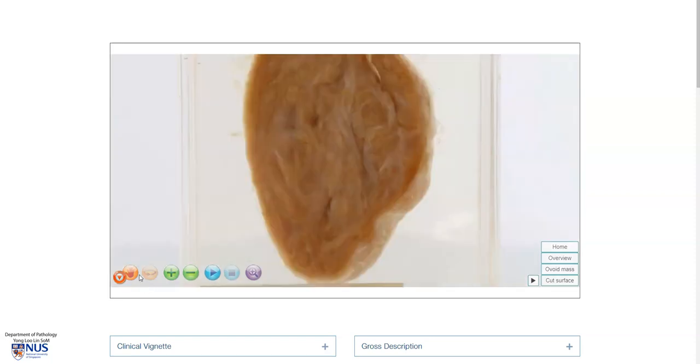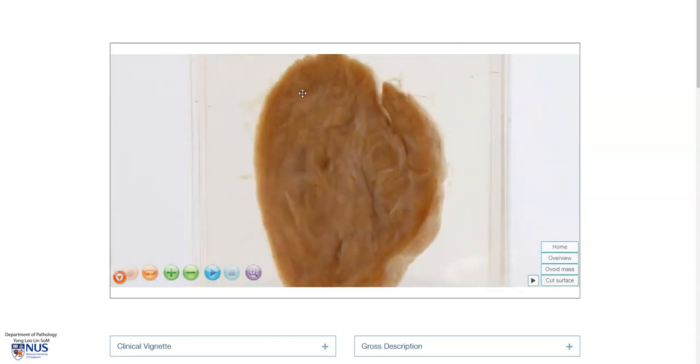This tumor has a pale, tan cut surface with some whitish areas representing collagen or fibrous tissue.